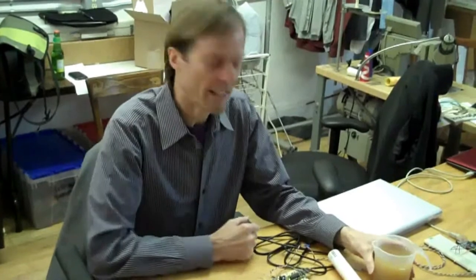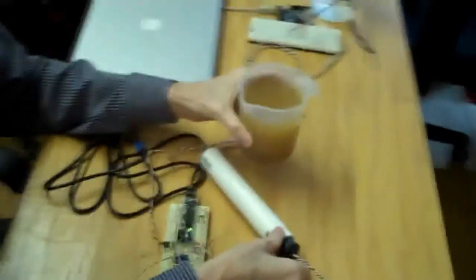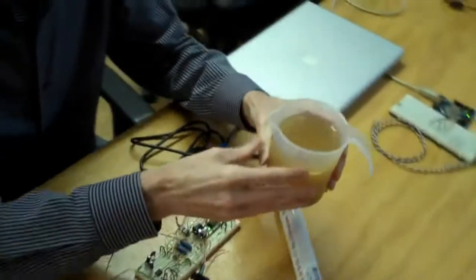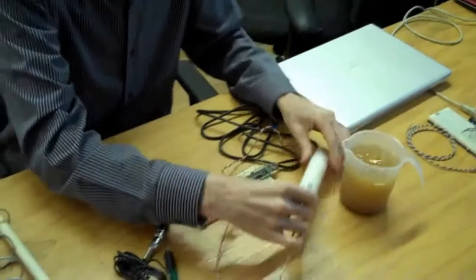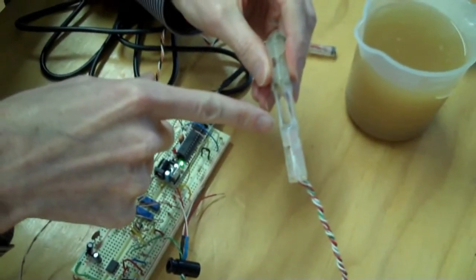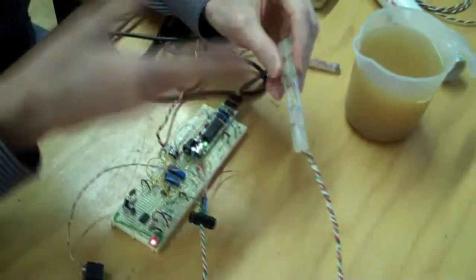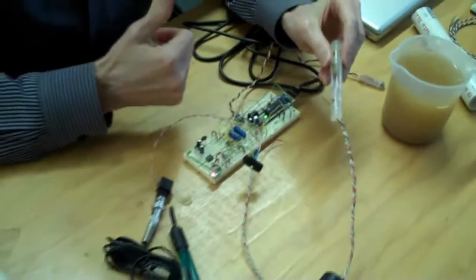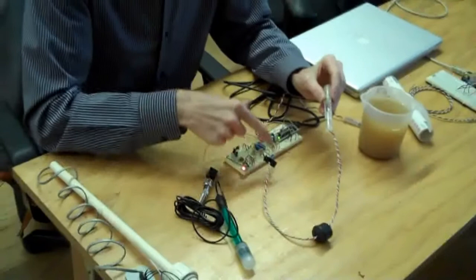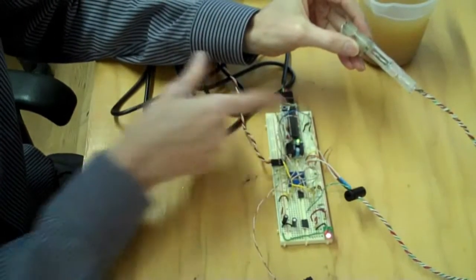Hi, I'm Rolf, and I'm working on the Arduino part of the BioBoard project. Right here we have an infrared absorption probe. As Ricky mentioned earlier, infrared absorption is an interesting thing to measure for measuring biomass, such as the yeast inside this Kombucha. There's basically an infrared LED facing an infrared phototransistor, and based on how much of the light makes it to the other side with Kombucha or whatever liquid flowing through there, we can determine how much of the light is absorbed. That signal goes through these wires as an analog signal to one of the inputs on the Arduino — in this case a Borduino, made by Adafruit.